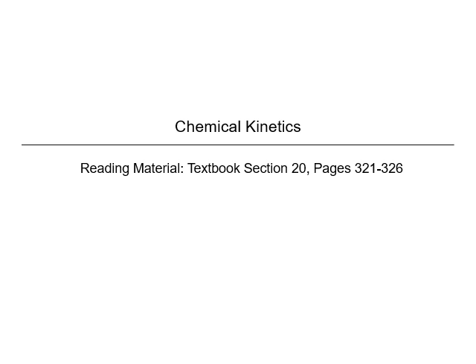Today I will be talking about chemical kinetics. So if chemistry is the study of change, then chemical kinetics is, at its core, pure chemistry. It's the study of how fast, how quickly reactions take place.